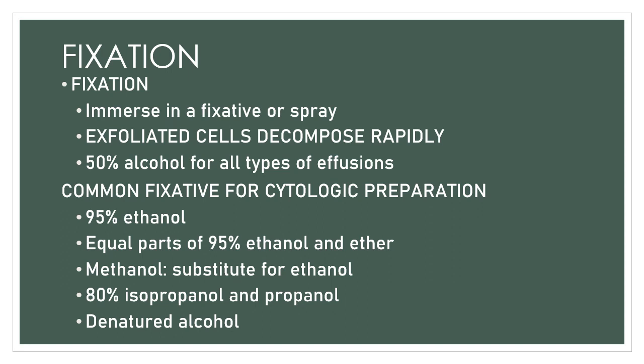Okay, and so with this, your 95% ethanol is actually used nowadays, no? And so your equal parts of 95% ethanol and ether, actually this one is the best fixative for cytologic preparation.